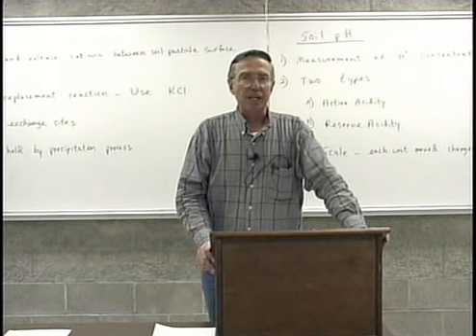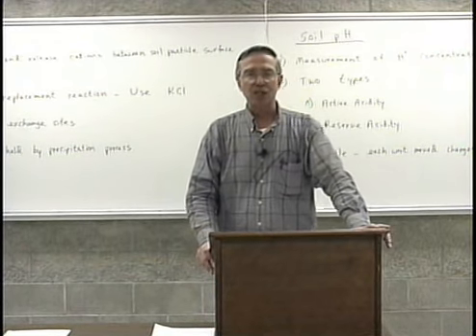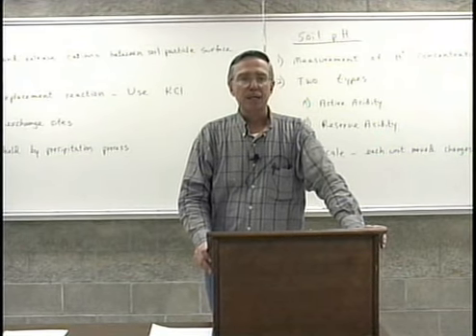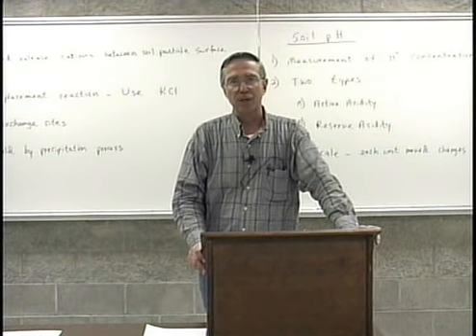Welcome to the Distance Learning Lab for Soils 201. Today's lab is going to be on cation exchange and soil pH. Previously in class we've talked about these two chemical characteristics of the soil.